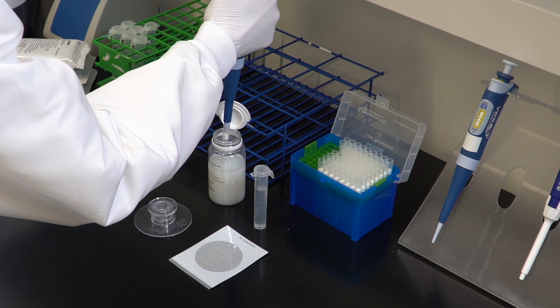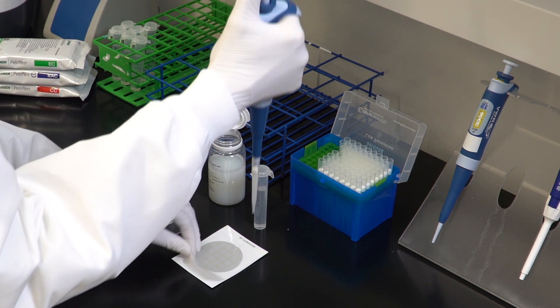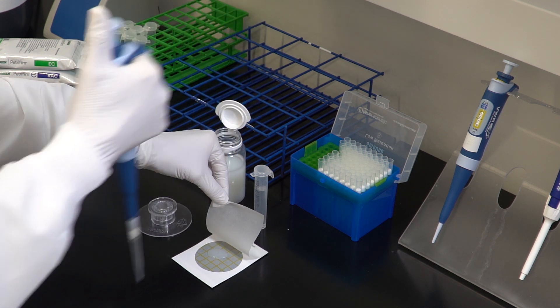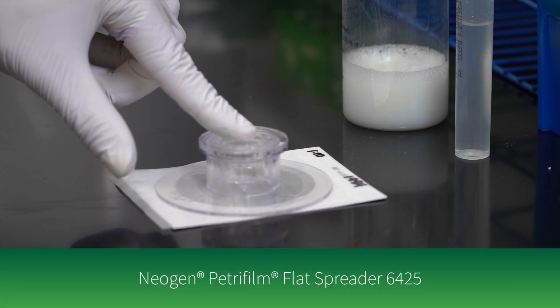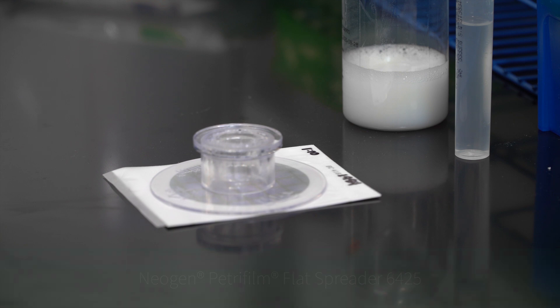To inoculate, lift the top film and dispense one milliliter of the prepared sample onto the center of the bottom film. Roll down the top film and place the Neogen Petri Foam flat spreader with the flat side down over the sample. Press gently to distribute the sample evenly.